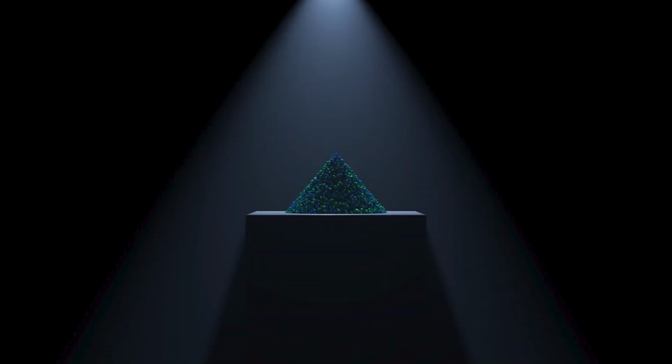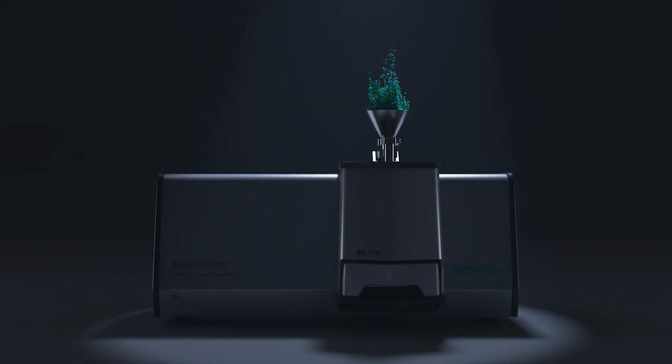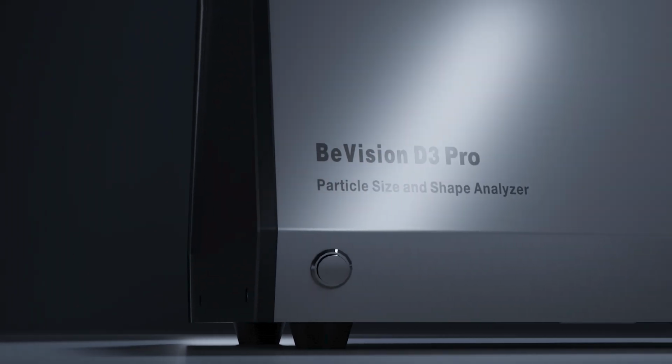How much of your sample are you really seeing? Traditional methods sort particles, but don't truly understand them. Meet the BeVision D3 Series.